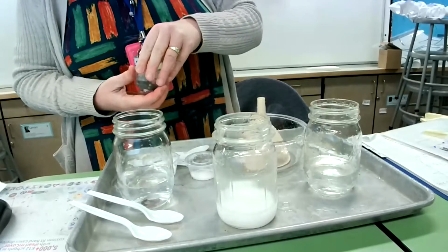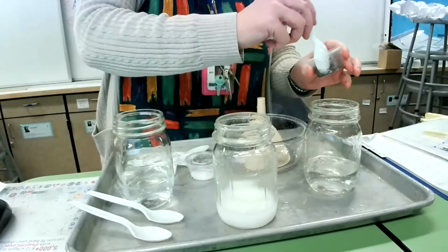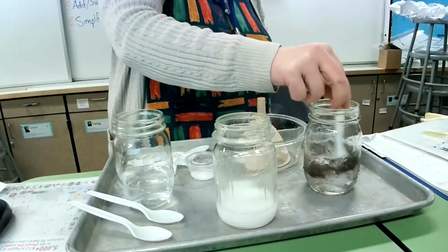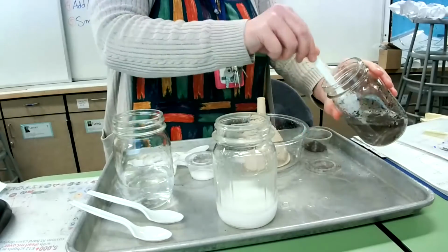All right. And then here is my last one. This is my soil, sand, bark mixture here. And I'm going to stir that up as much as I can here. I'm going to get some of it off the sides.